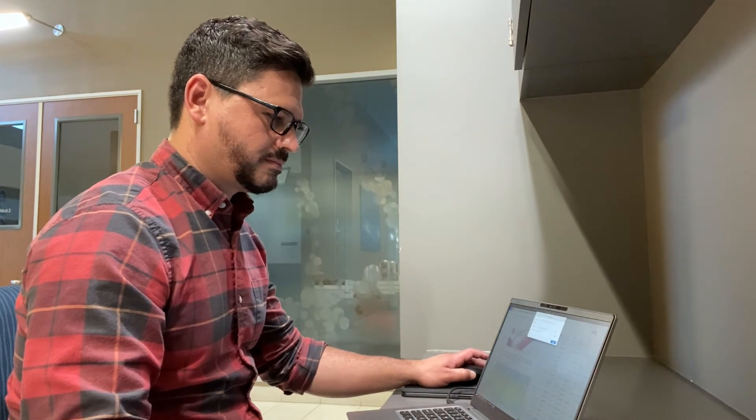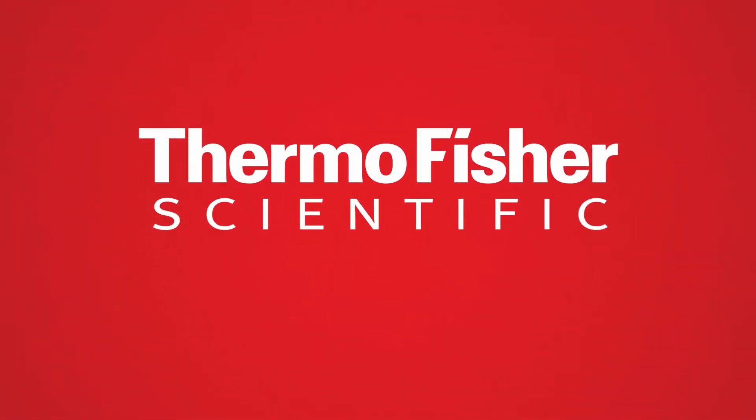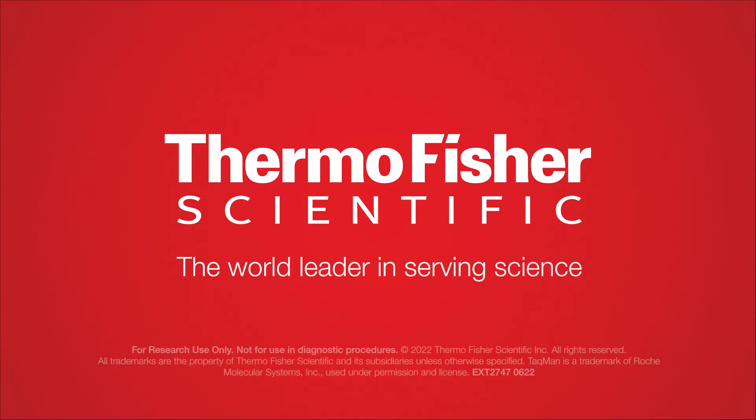All that's left to do now is check the results.